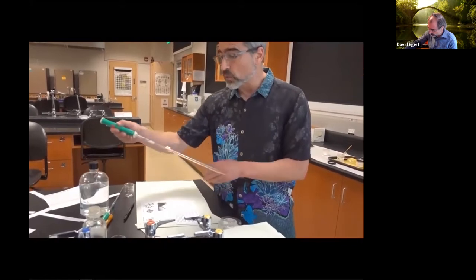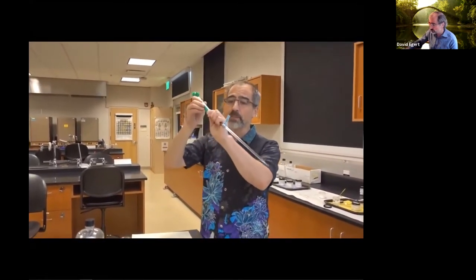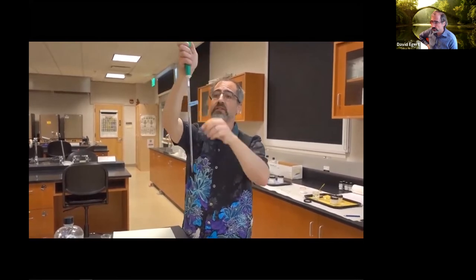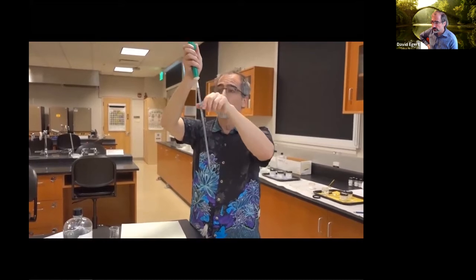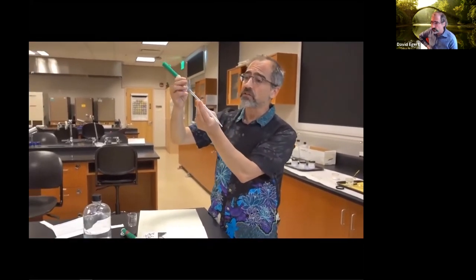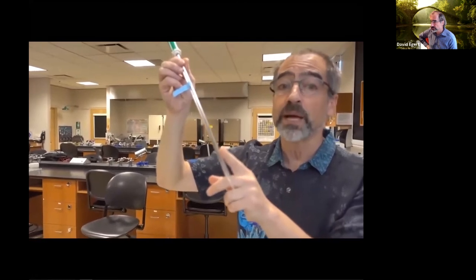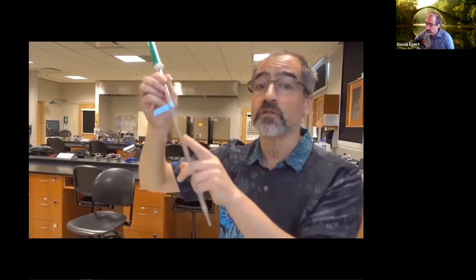To measure out the distilled water, I'm going to use a pipette. These pipettes are for much more accurate volume measurements. You always want to use one of these little pipetter attachments here, which basically sucks up. You don't want to ever use your mouth-to-mouth pipette because you might get something inside you don't want. These are a little confusing for people at first to understand. They come in different volumes. This one here is a 5 mil pipette, and it's designed to dispense volumes up to 5 milliliters.